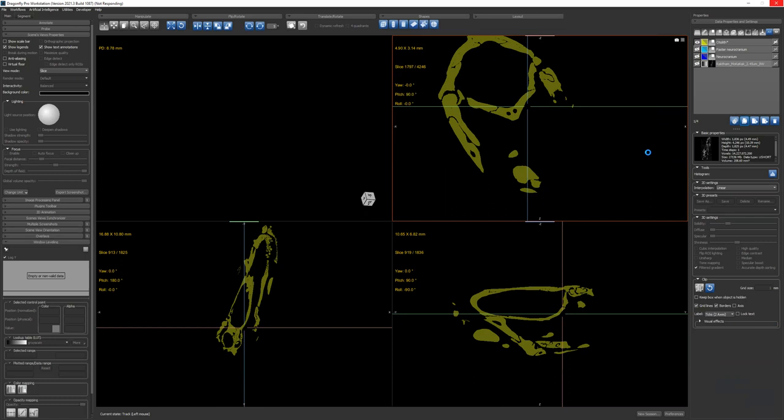So we always make a copy. And it takes a little bit. This particular data set is 27 gigabytes. All right, so we have a copy. So now we have almost 60 gigabytes tied up in this, which is a huge amount.